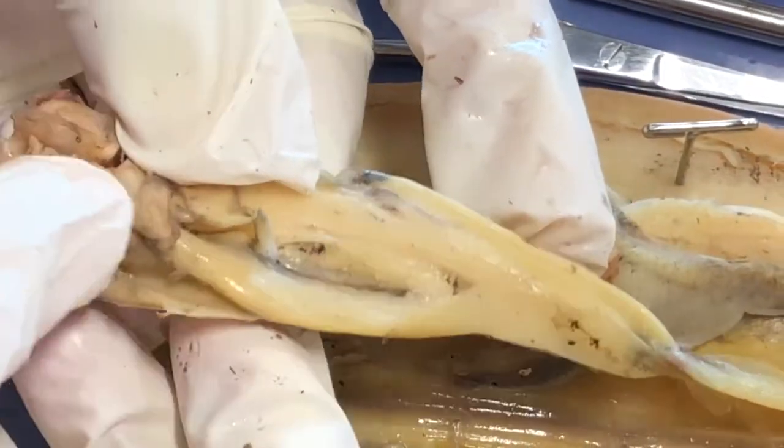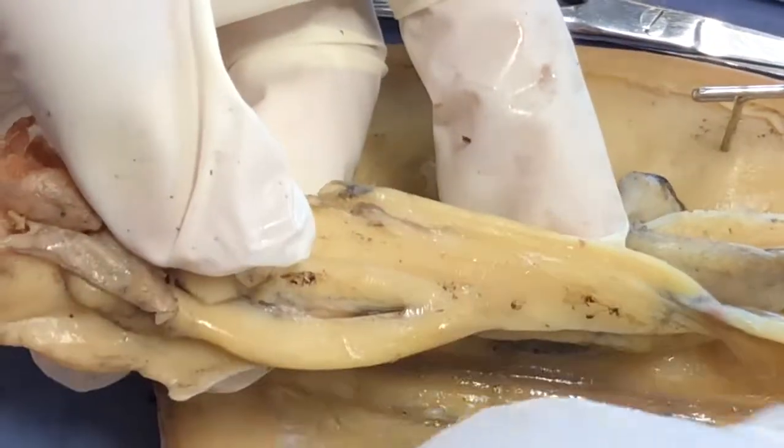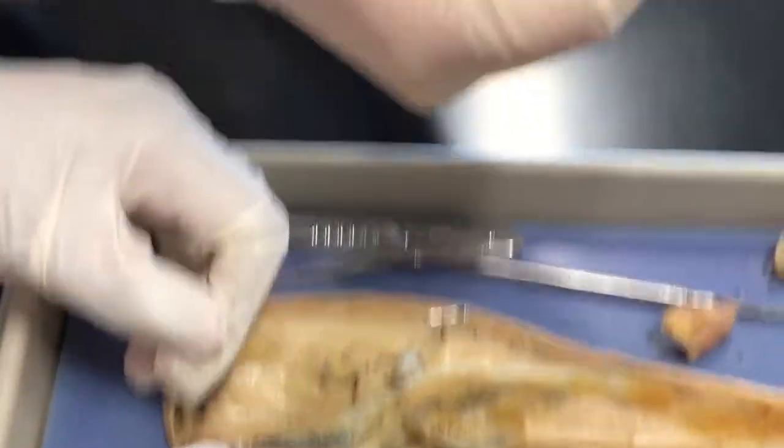As you can see, we're pointing to the stomach, which is the muscular organ that digests food, with the help of the secretions from the liver and the pancreas. Okay, as you can also see, right next to the stomach is the intestines, which expels the waste.